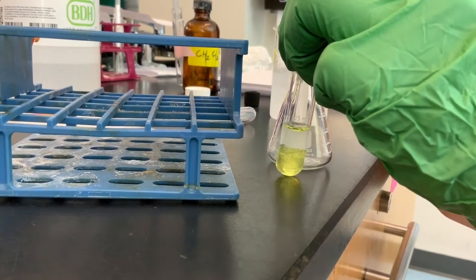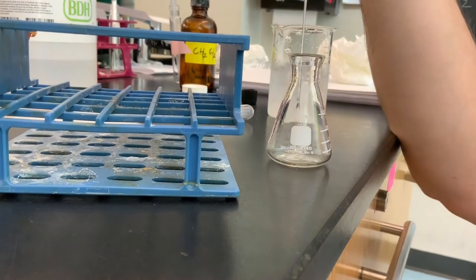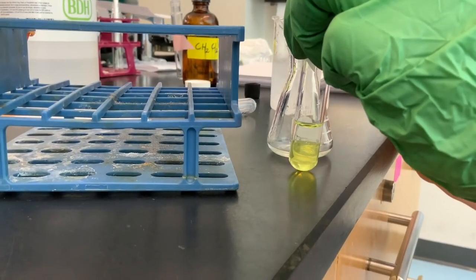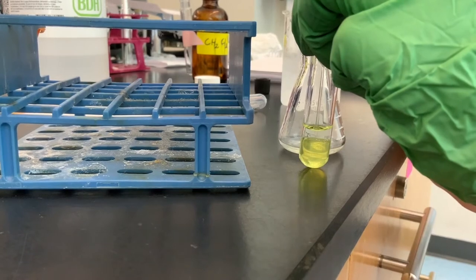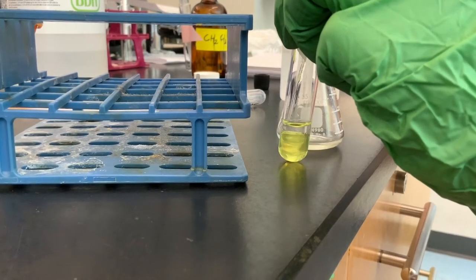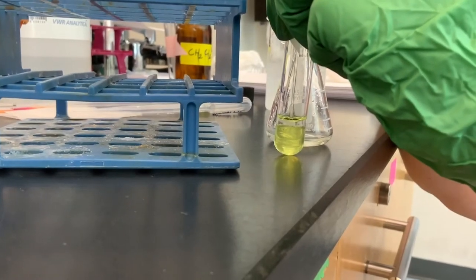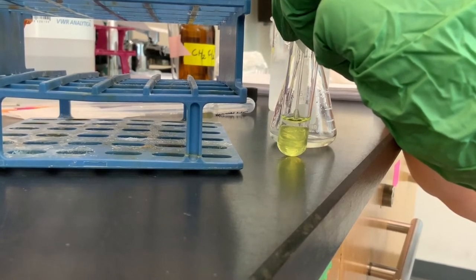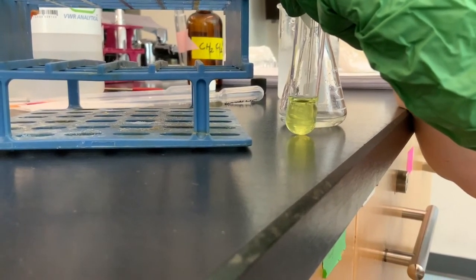But anyway, here I'm now transferring over that first amount of basic aqueous layer with sodium benzoate, diving down again to get more, trying to avoid the yellow methylene chloride layer as best I can. But again, it's difficult because of the refraction here. You can barely see the glass tip of the pipette. Wow, that was cool.